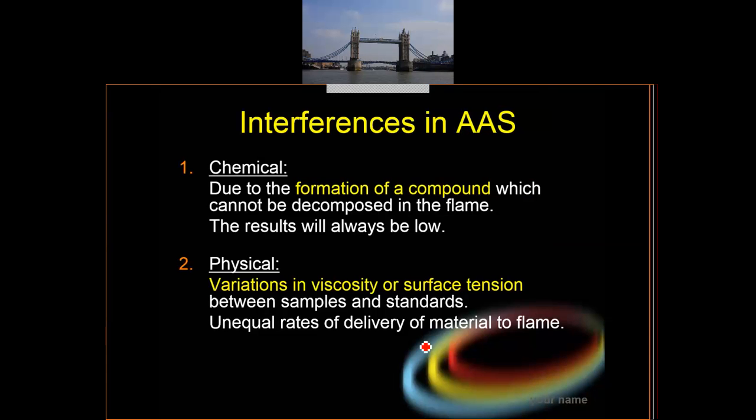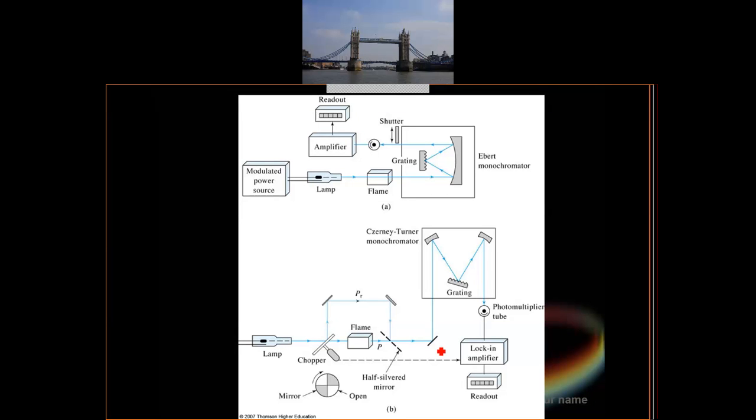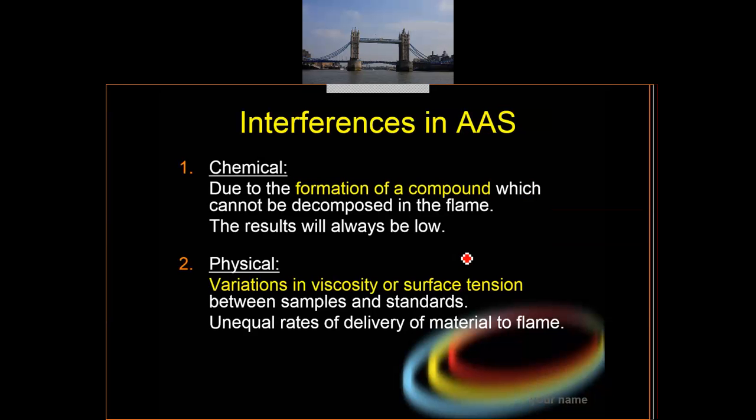Okay, but normally I never ask about the schematic diagram of this one, single or double beam. But we do have to discuss this problem. So we have some problems regarding usage of AAS.